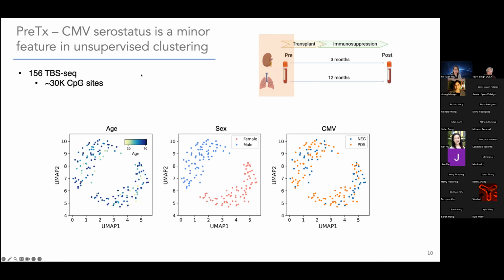any immunosuppression prophylaxis involved. For these targeted bisulfite sequencing samples, every one of them will acquire more than 30K CpG sites to analyze. From these metrics, we are trying to see if there are any correlations with the traits we're interested in. As expected, we see methylation is highly correlated with the main trait, which is sex. So you can see the populations are grouped very well by sex.